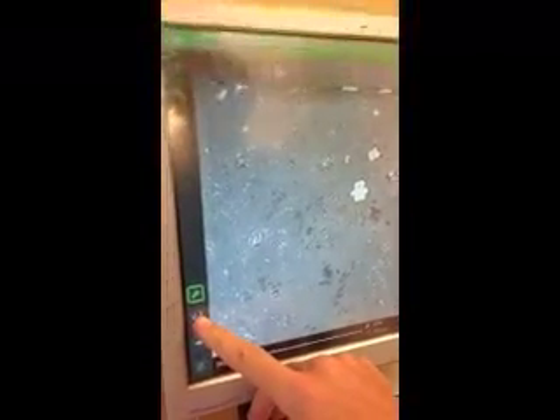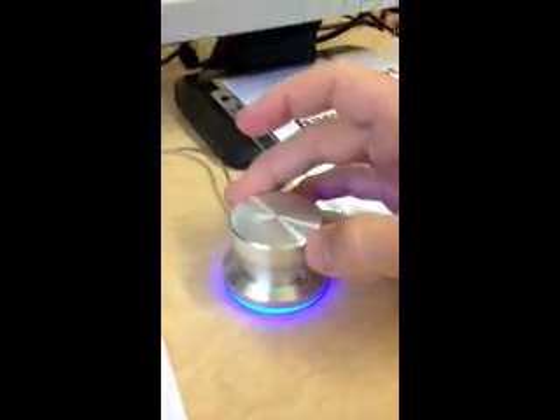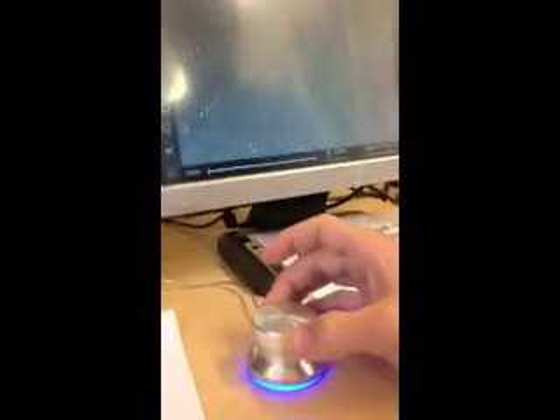And the contrast button is right above the focus. You can press that if you think it looks a little too bright. And then if you want to zoom in on anything specific — so I want to zoom in on this dark spot — I'm going to turn the knob to the right and it will zoom in. It will be out of focus at first, and then you can press autofocus.